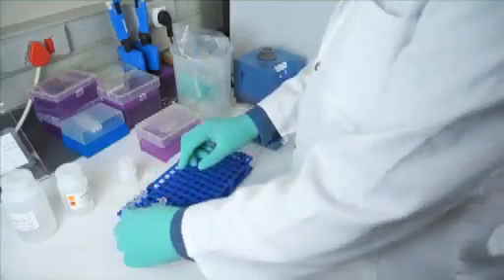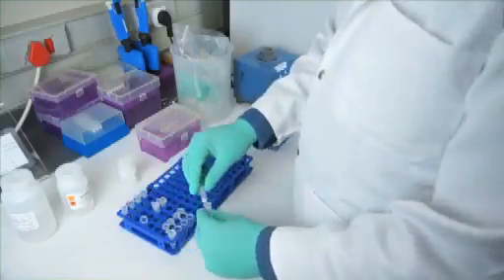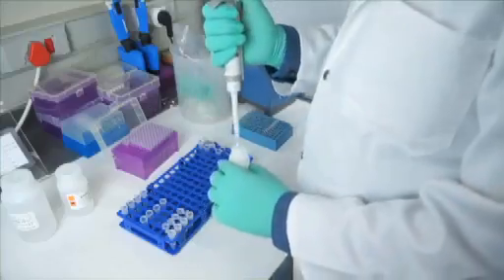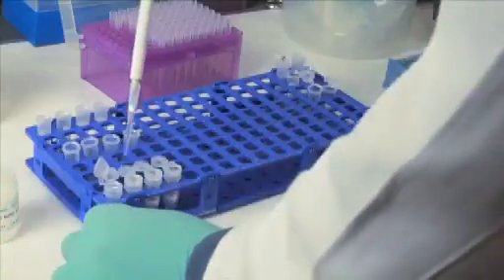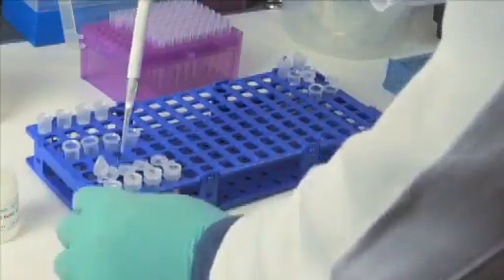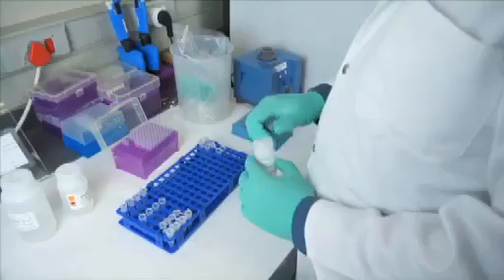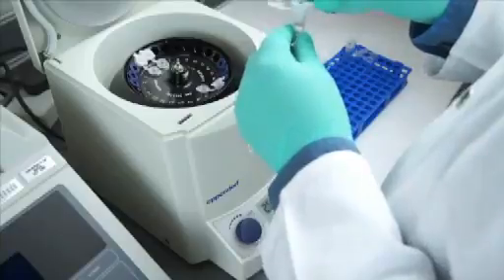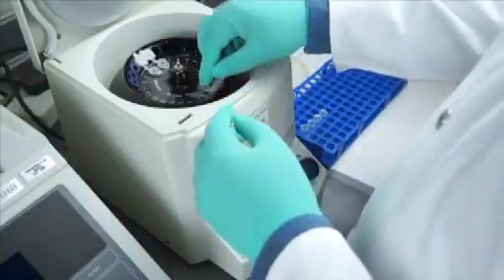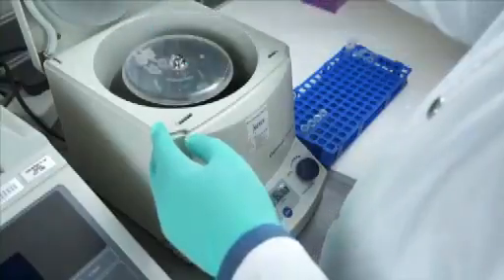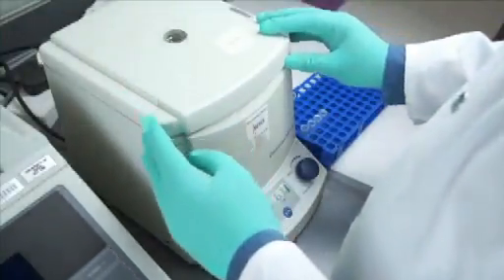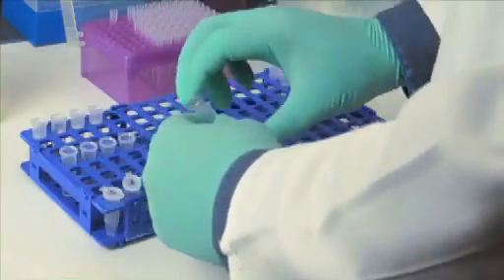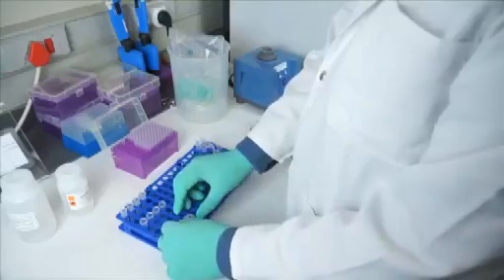Place the spin column in a clean 1.7 milliliter elution tube. Add 40 microliters of elution buffer to the center of the column and incubate the column at room temperature for 1 minute. Centrifuge the column at maximum speed for 2 to 3 minutes. The elution tube contains your purified PCR product ready for sequencing. Discard the column.